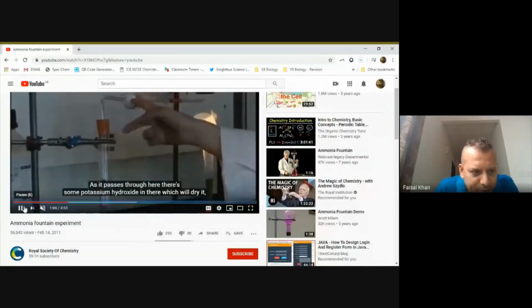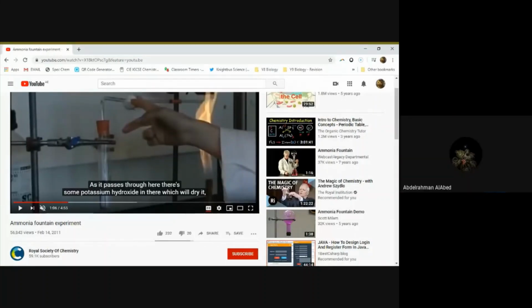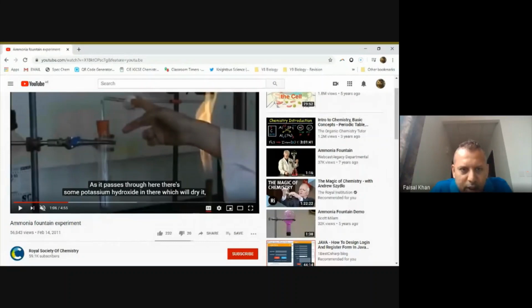This liquid over here, let me just pause it here. This liquid over here is liquid ammonia. They called it 880 ammonia, but it's actually ammonia gas that's being dissolved in water. Okay, and when you heat it, you can vaporize that ammonia and it forms a gas.